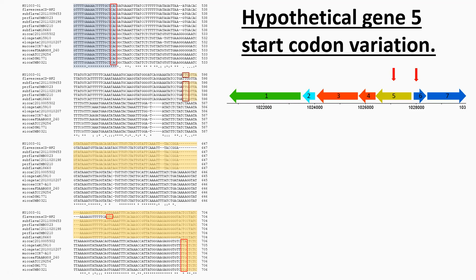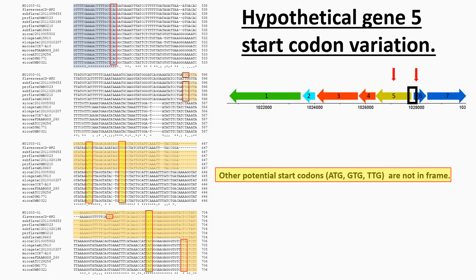You can see here for the sub-flava, per-flava, generally they were predicted with the start that was here. For some of the other species, it predicted the start to be here. But in both cases, it predicted the start codon to be TTG, which was unusual.